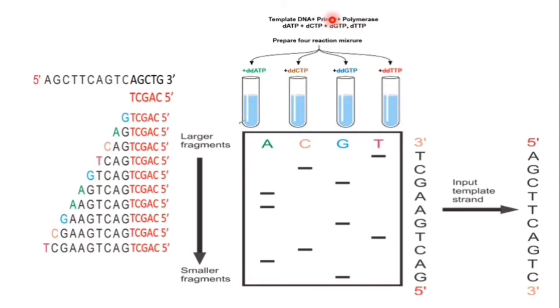You have to remember that the primer should be labeled. This is the reaction mixture, with deoxyadenosine triphosphate, dCTP, dGTP and dTTP.